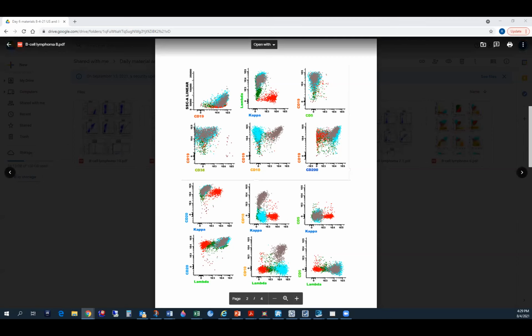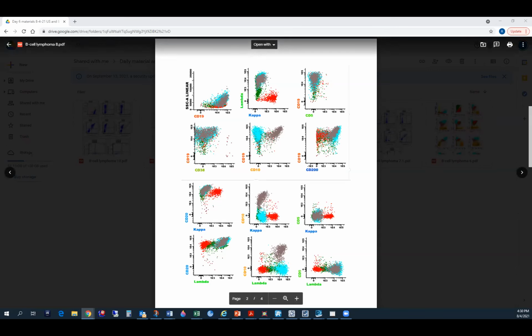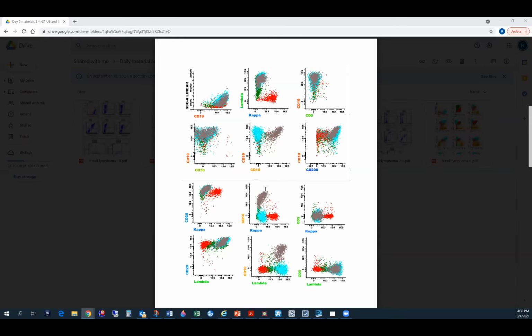And when you do the percentage, is there any particular plot that you choose where you circle and draw the percentage, or where you see it as a discrete population? So when you use quadrants, the quadrants will display the percentage of cells in that quadrant. In cases like this, there is a front page that has a lot of patient info. I'm not displaying them here. So on the front page, you will see the percentage of these cells as a subpopulation.